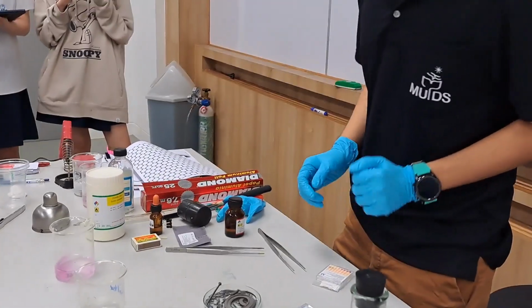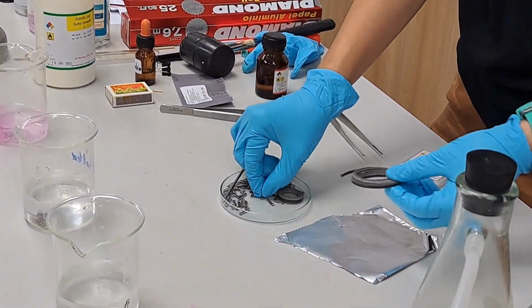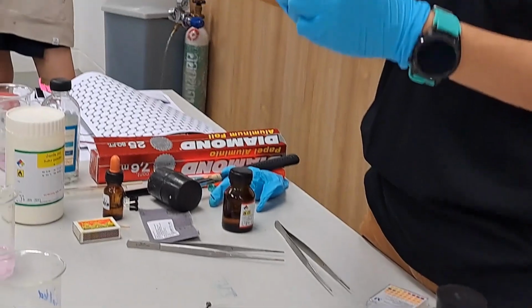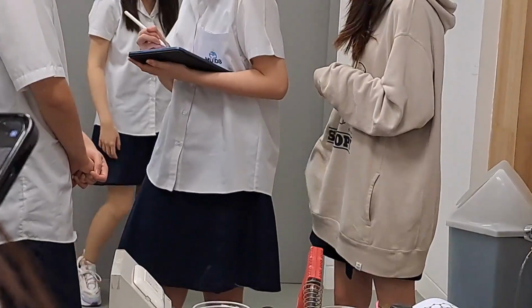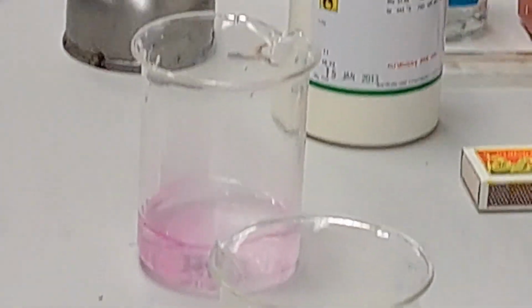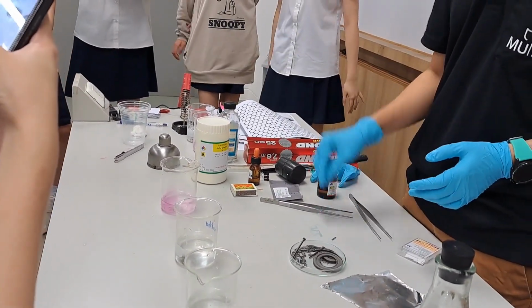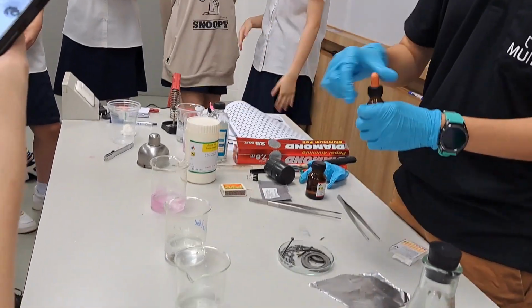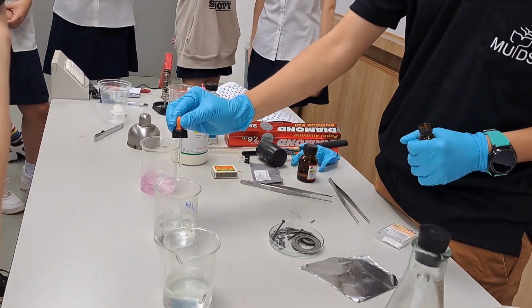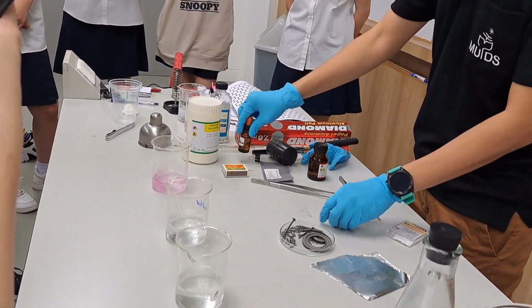All right. Next group is magnesium. Okay, and there are going to be two demonstrations for magnesium. First, the smoke is hydrogen gas. Okay, and this is a piece of magnesium metal. We're going to do the same thing as with sodium. So this is another beaker of tap water, with some phenolphthalein. Just add that for the other demonstration.